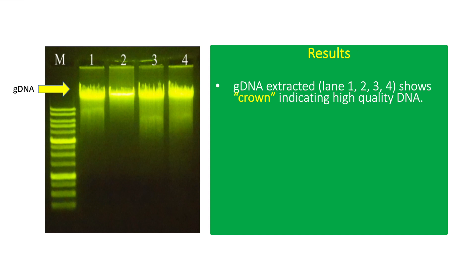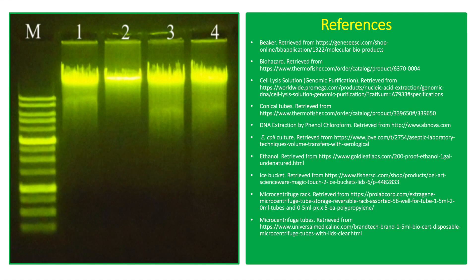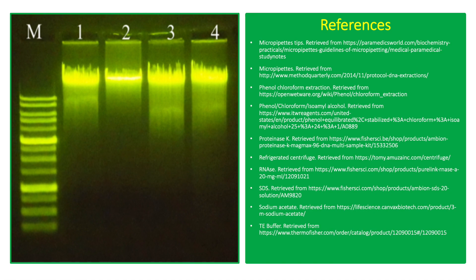This is an actual result showing genomic DNA extracted from bacterial culture using the phenol-chloroform method. The gDNA shows a crown-like appearance, indicating high quality DNA with minimal degradation. The gDNA band is commonly observed above the highest band in the DNA ladder, which is approximately 10,000 base pairs. Low quality gDNA shows smearing, indicating DNA degradation or phenol-chloroform contamination, which can significantly affect downstream applications such as PCR.